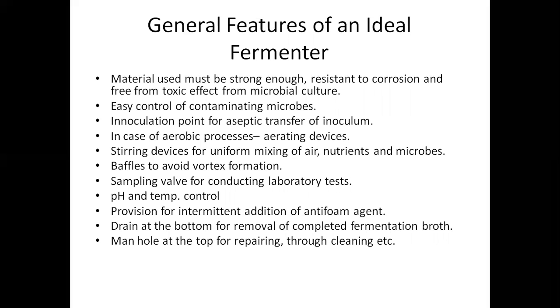From time to time, as the fermentation process or the biochemical production process goes on, there arises a need to check the sample for the conditions inside, the concentrations and different parameters inside the fermenter vessel. So sampling valves are utilized to take out samples at different times and test them in the laboratories.